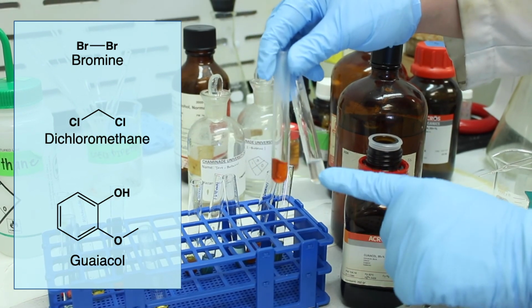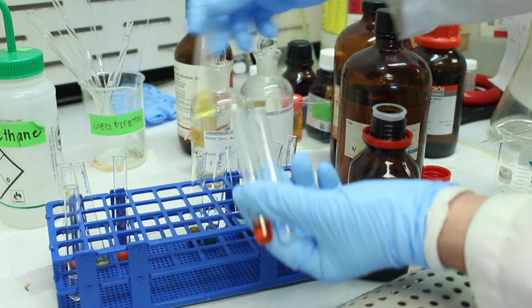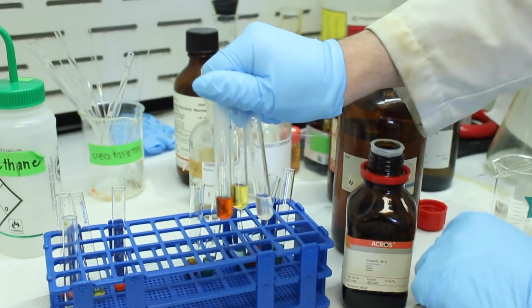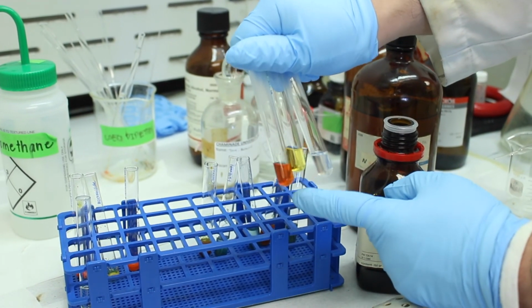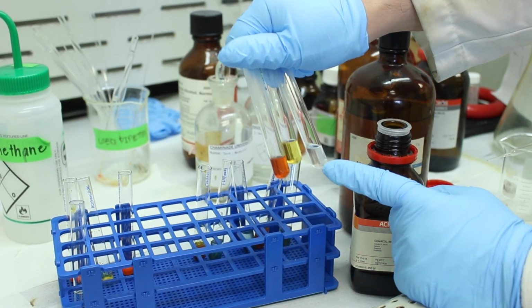We went from red to colorless, right? So if we compare our bromine tests, on the left is your control, so just DCM and bromine. On the right is the dimethyl maleate. So this is the one with an electron withdrawing group, which needed heat. And then we have our guaiacol. So this was an EAS reaction.